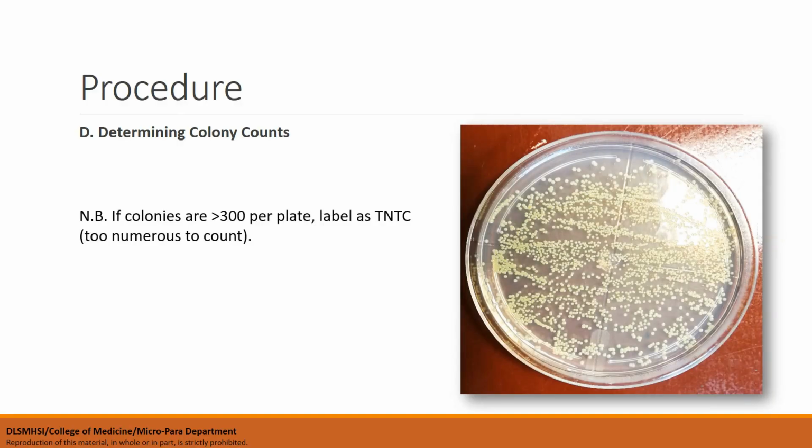If you have colonies greater than 300 per plate, no need to count each colony, but you can just label it as TNTC or too numerous to count. So that's all again for today.